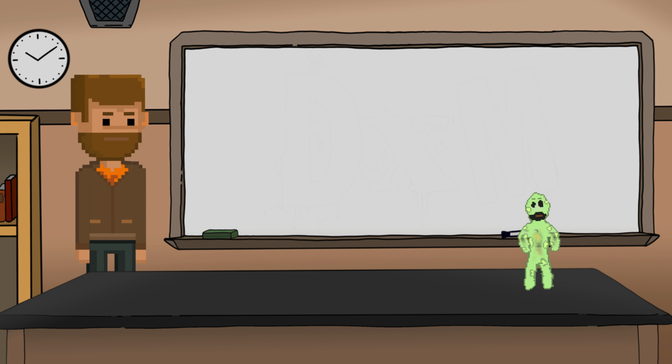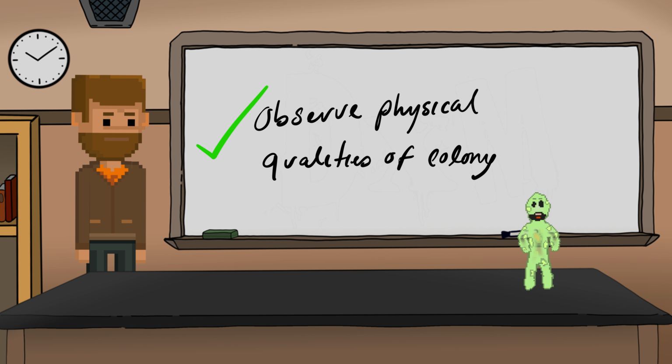Now that you are in your own little bubble, start by observing the physical qualities of your colony. Remember to use what you learned in lecture, lab, and your textbook to describe it properly. This shouldn't take too long.